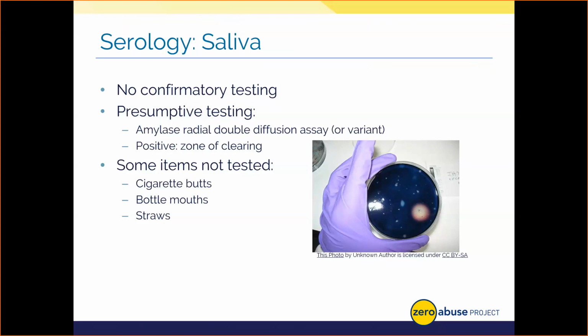From a chemical structure standpoint, starch actually has large grooves in it. And so the iodine actually binds to those grooves and your agar turns a dark blue or purple color if amylase is not present. For a positive result, in other words, amylase is present, the well in the area around it where the sample diffuses will be made up of simple sugar. That's where the starch has been broken down, or eaten or digested, if you will, by the amylase.